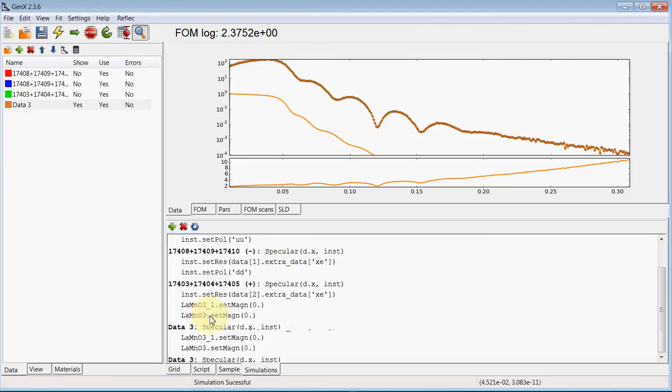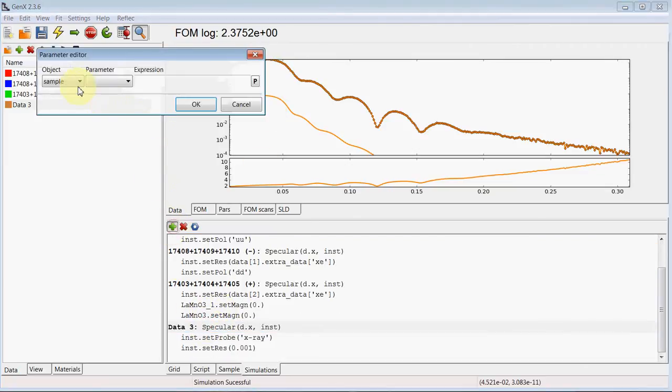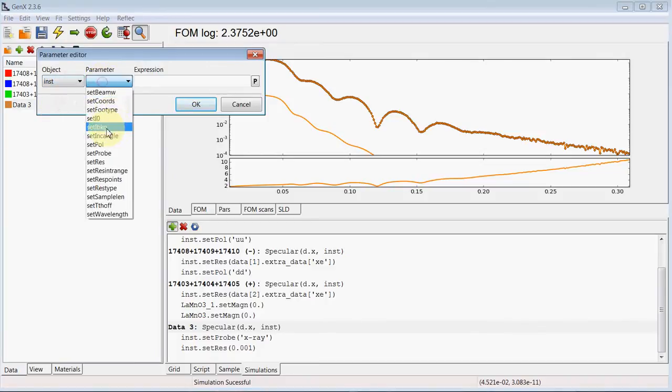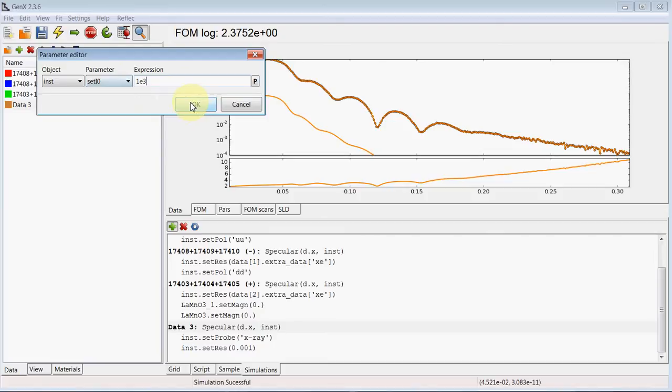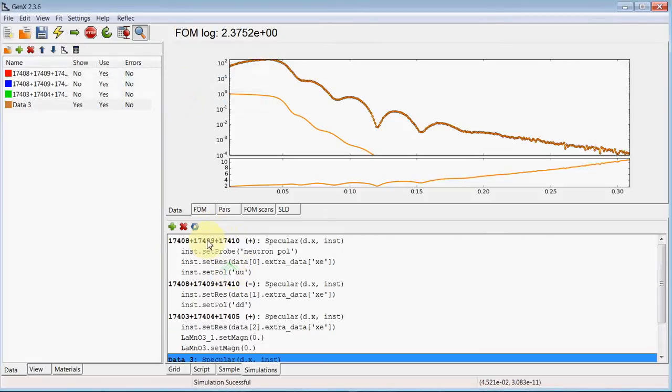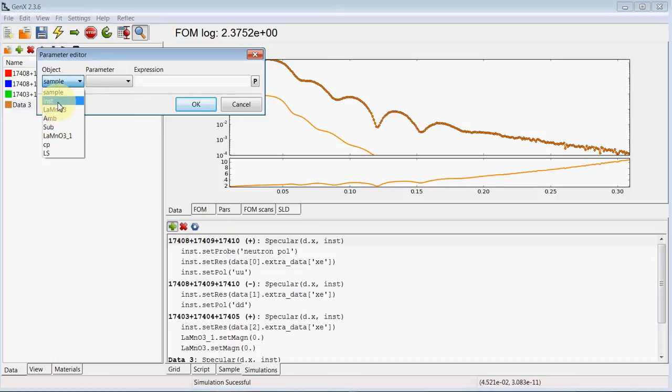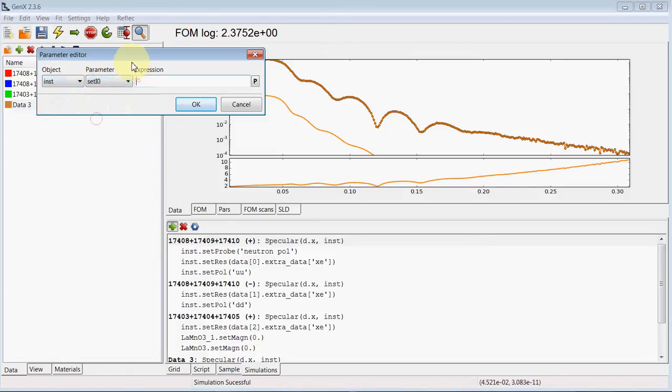So for the scaling we use instrument set I0, and in this case we'll try 10 to the power of 3. This we need to reset at the beginning with instrument set I0 1.0 for neutron.